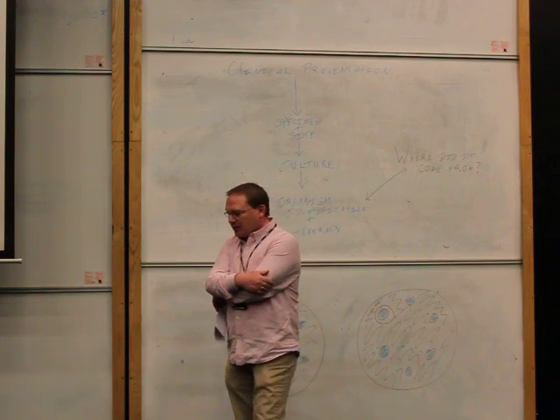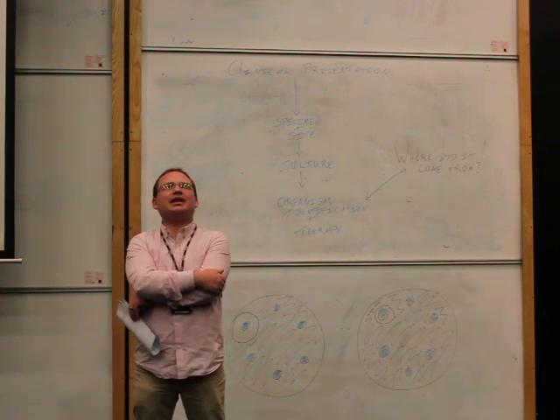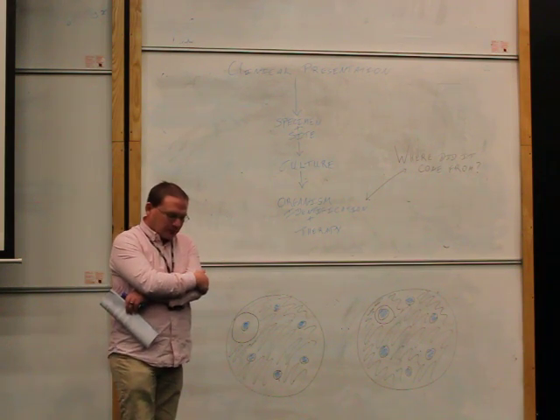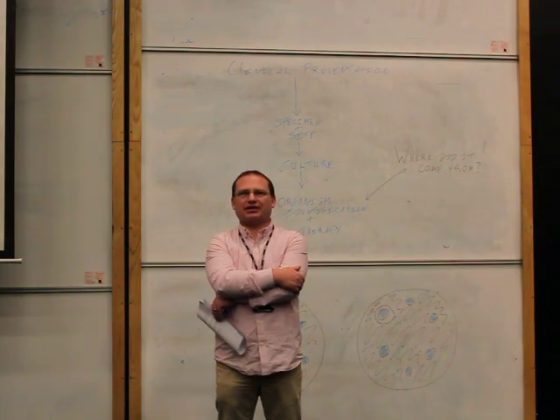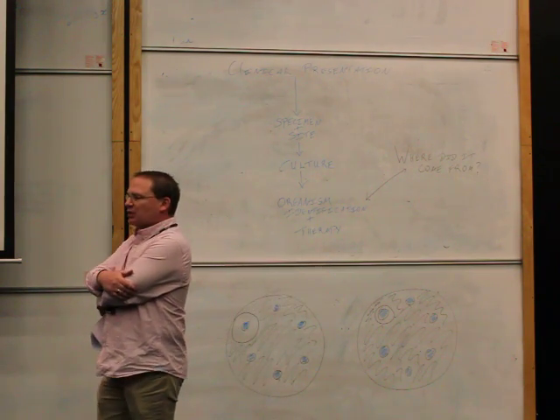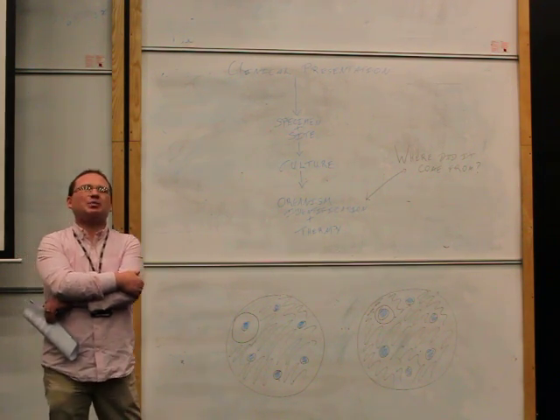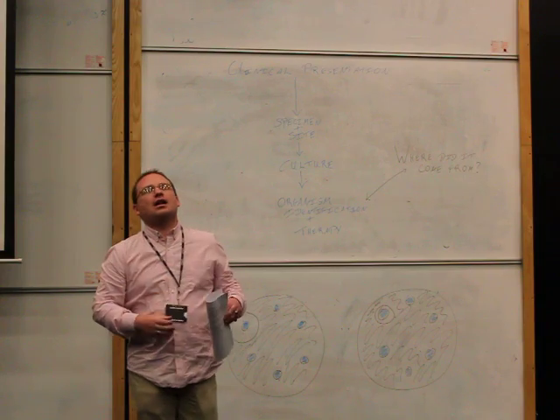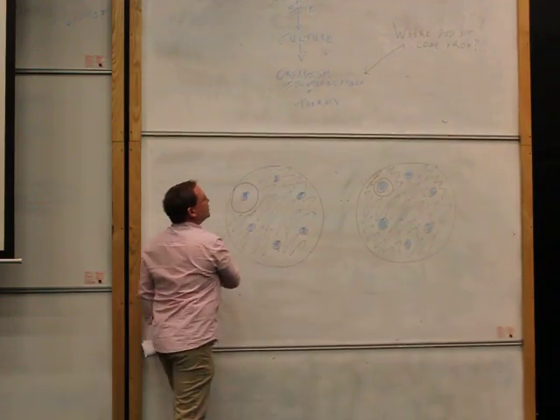So once you've identified the organism, you need to confirm that it is actually the organism that that baby has been contaminated with. Now, one way of doing this is to compare antibiotic sensitivity patterns. It would be safe to assume that if you've got the same organism, then the antibiotic sensitivity pattern produced by the organism on the baby will be the same as that from one of the members of staff. Now this will require a bit of interpretation on your behalf and make up a majority of case 1.